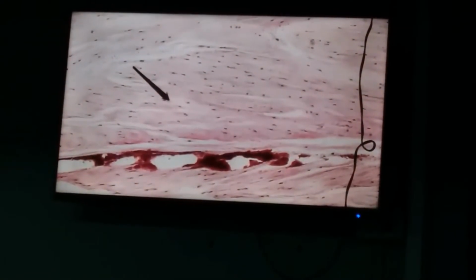It is found in this slide. Slide number... slide please. Intervertebral disc. Okay. So this third or last type of cartilage is found in slide number 11. This is your intervertebral disc.